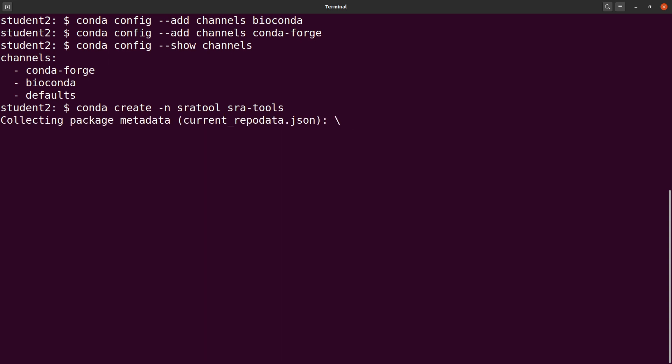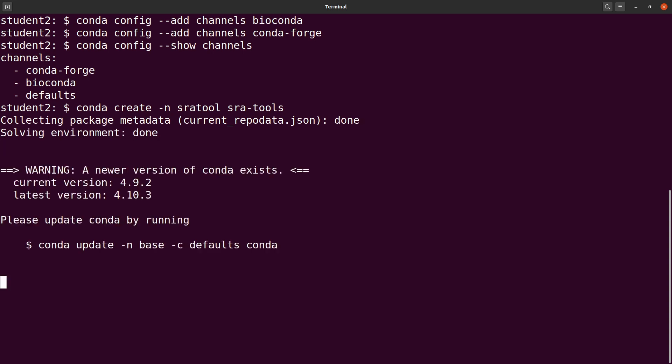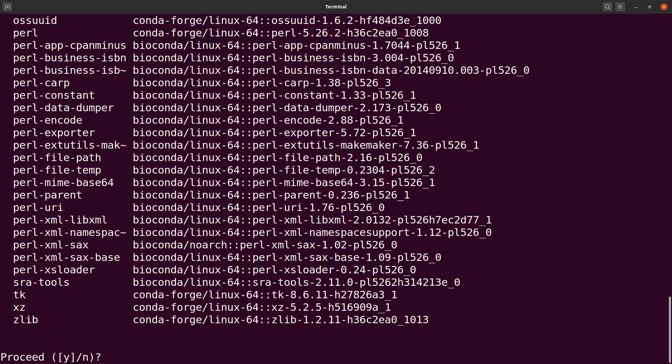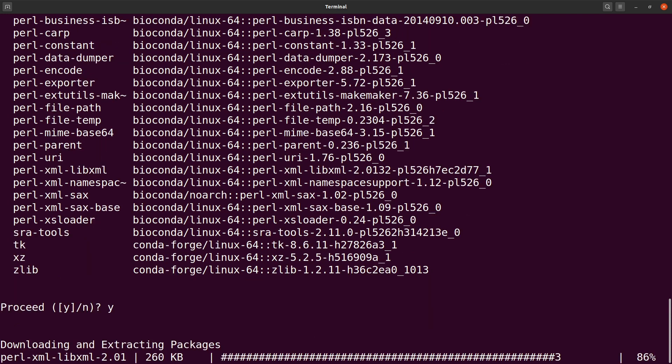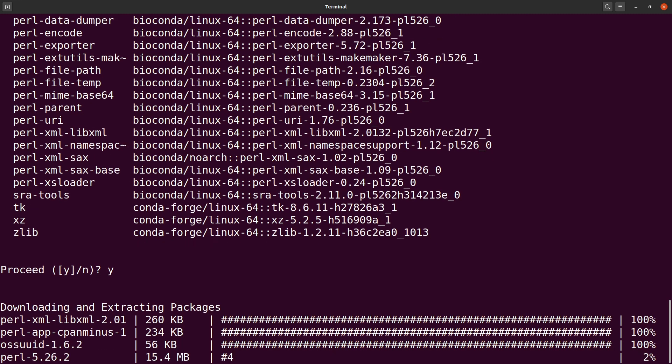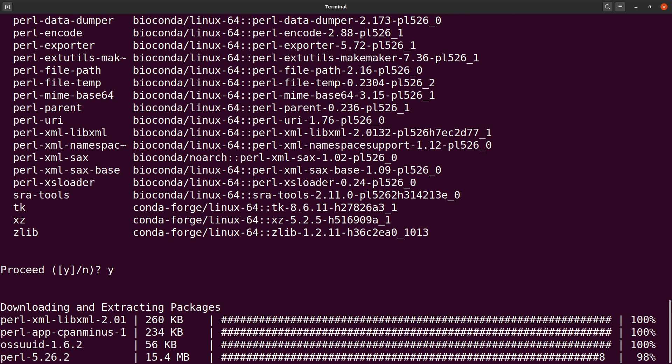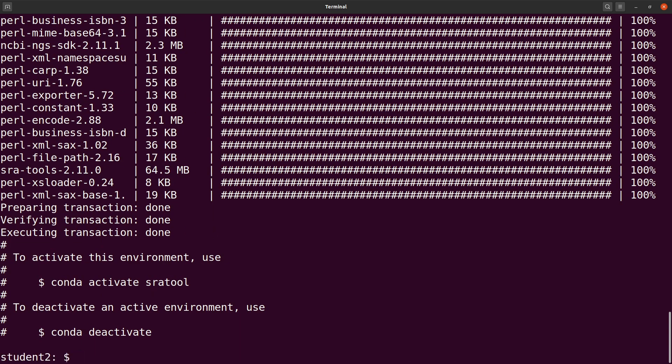Let's wait for the prompt to install. Now we type Y for yes and we hit the enter key. We wait for the downloads to be done and then installation will also be done. Installation is complete.